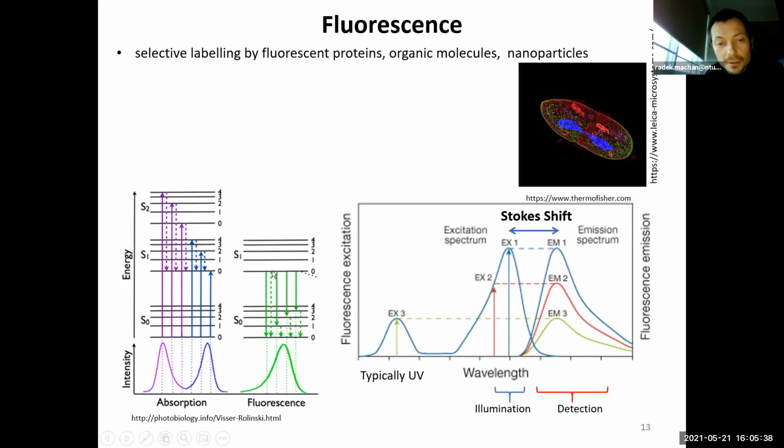There are different energy levels to which the molecule can be excited, but then typically very fast the molecule returns to level S1, the lowest.